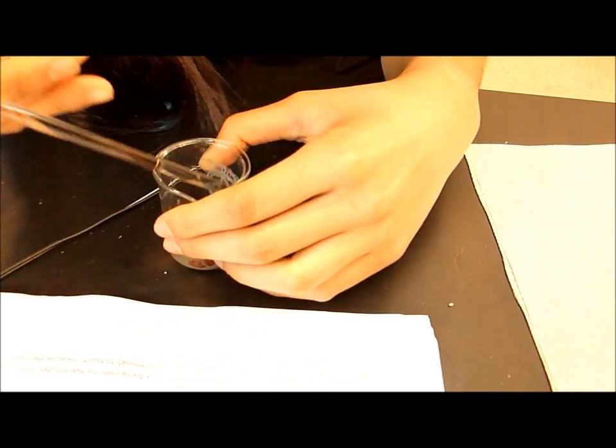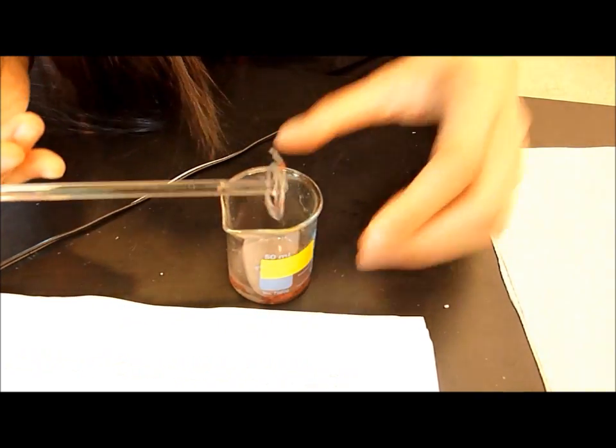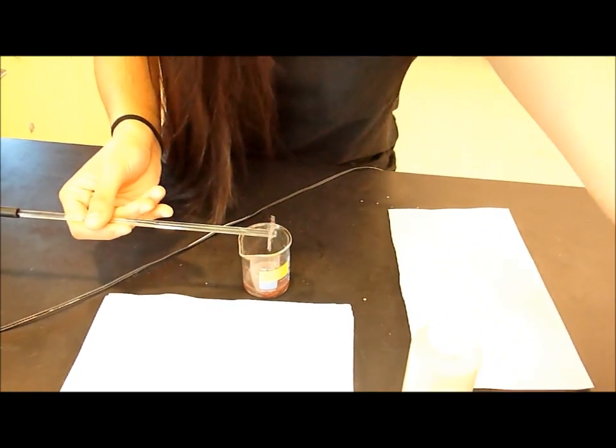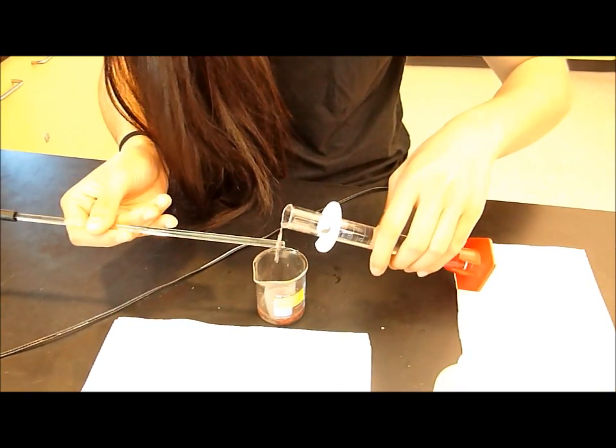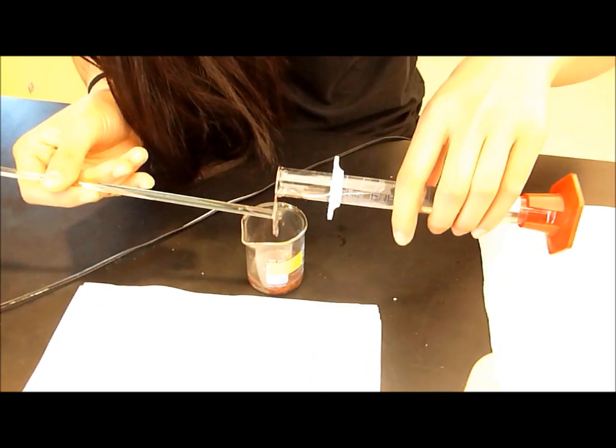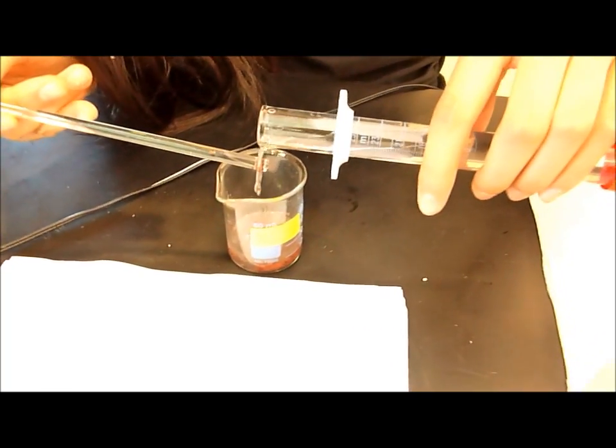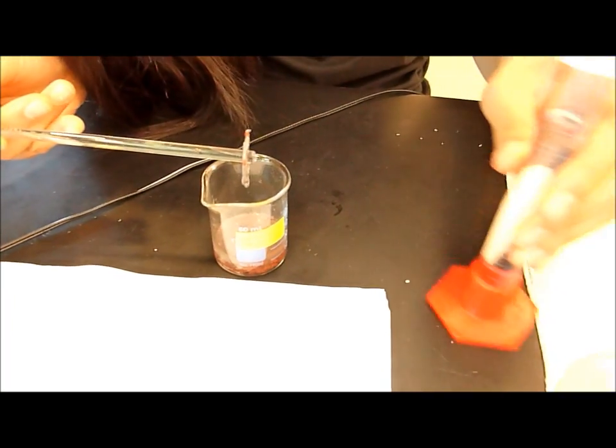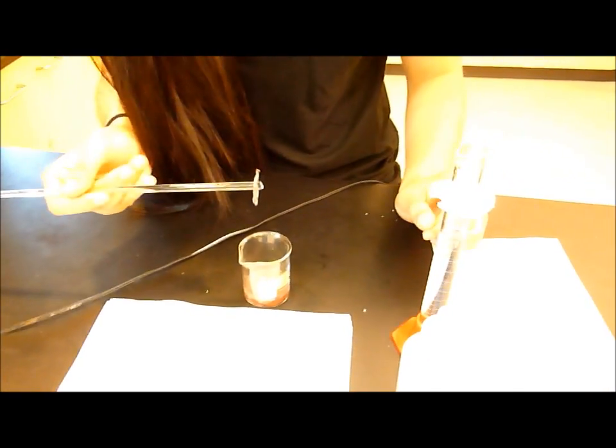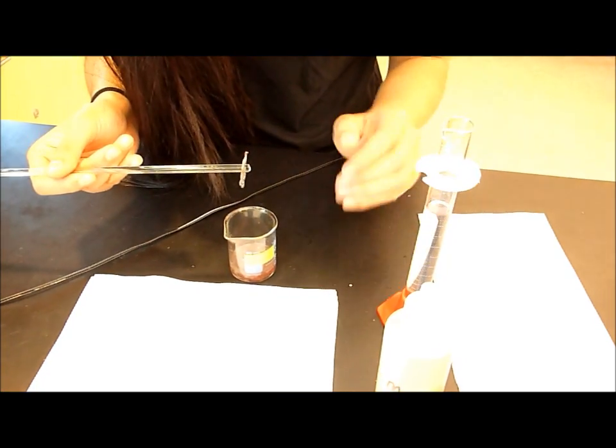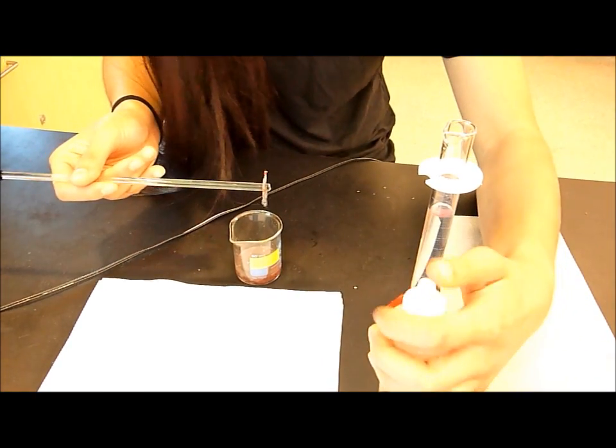Then, rinse off any remaining copper with distilled water into the solution. If any of the copper refuses to wash off the aluminum wire, wash it with one or two drops of six-molar hydrochloric acid solution.